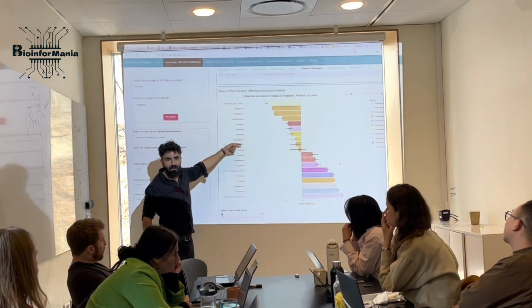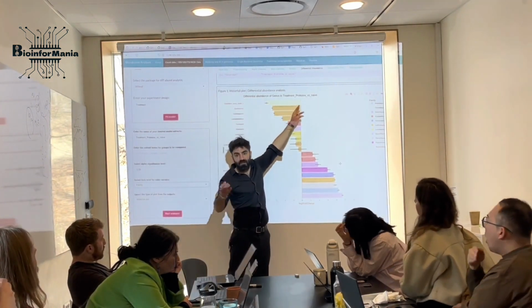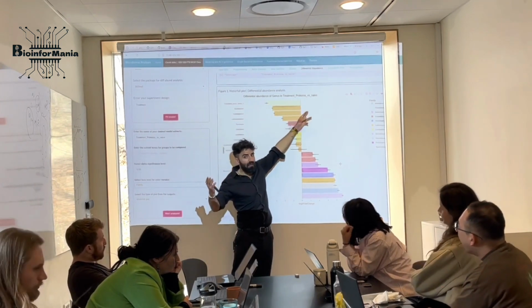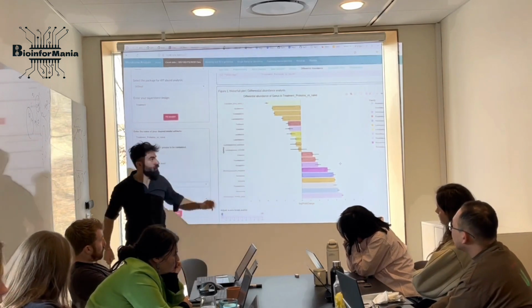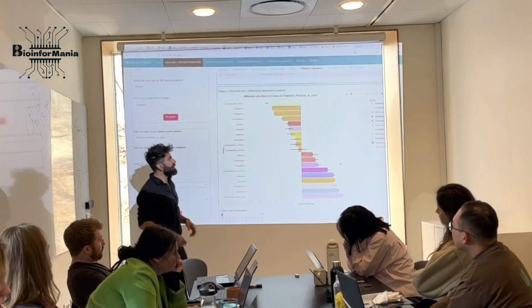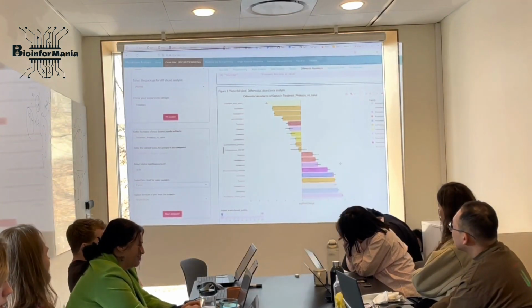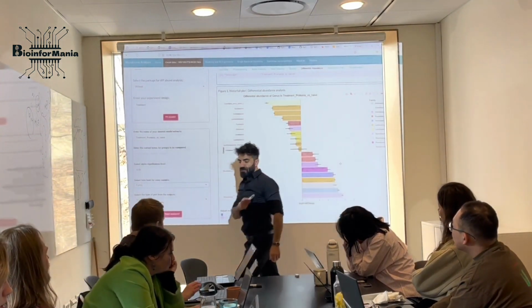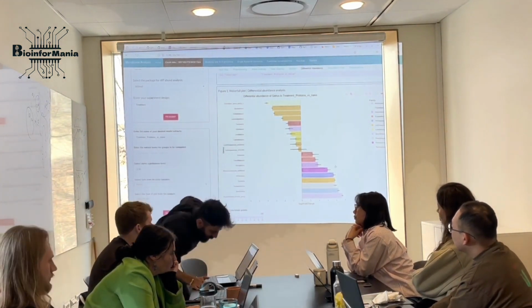In your expression data, and this is here. If it's about a sample, or a cell, this is going to be this cell against this cell, okay? So you compare that, and remember that's why I said the order of this guy up there is important, because you need to know who is going to be your numerator, who is going to be your denominator, okay?